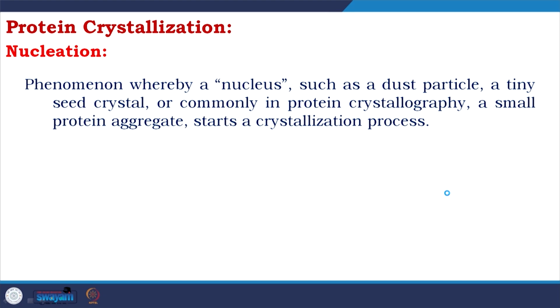Remember, I talked about what you are doing. You have a protein solution, you add precipitant, there is slow dehydration. So, the concentration of protein is increasing in the drop, and slowly through this dehydration there is a change of phase from liquid to solid. In between there is one unique phase point where the crystal would grow, and you are very lucky if you get that.